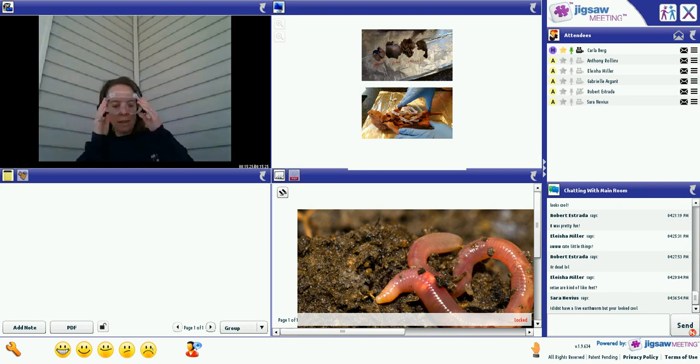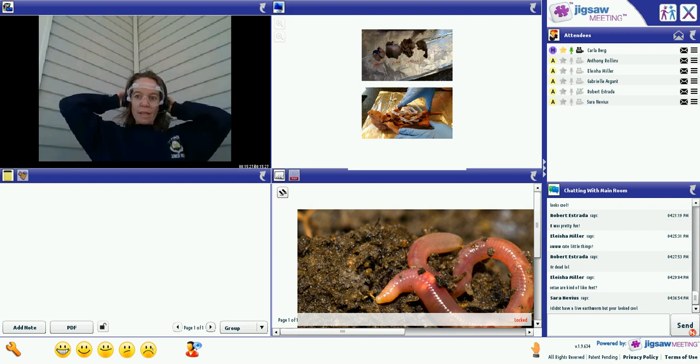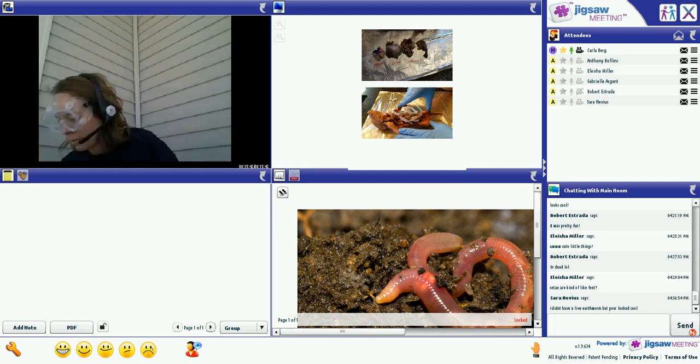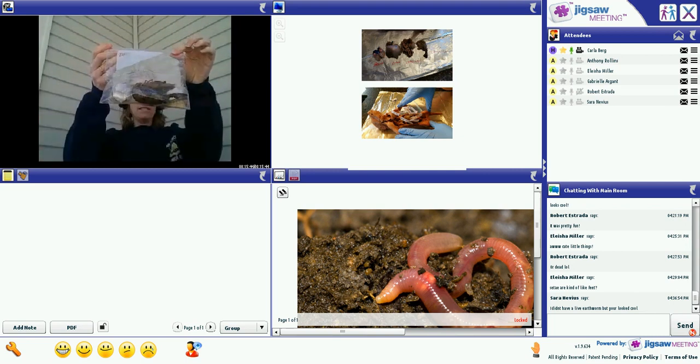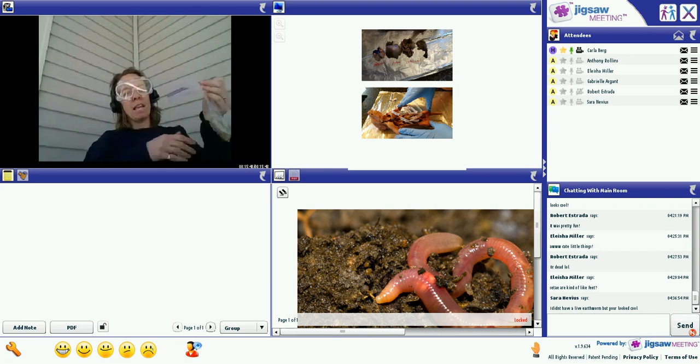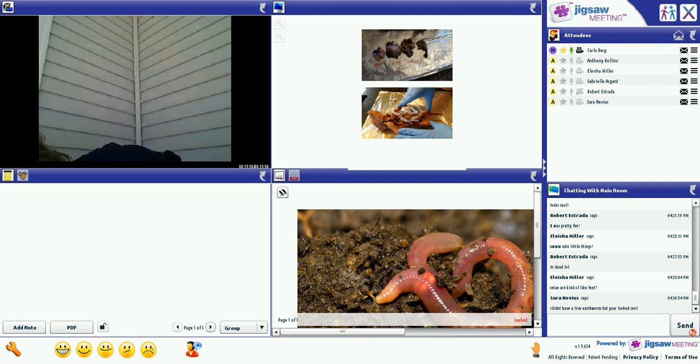Okay, now you are going to need your dissecting tray. You are going to need your blue kit. You are going to want your magnifying glass. You are going to need your Ziploc of specimens. Inside your box, there's a Ziploc with a worm, an eye, and a crayfish. Take that out, but do not open it yet.